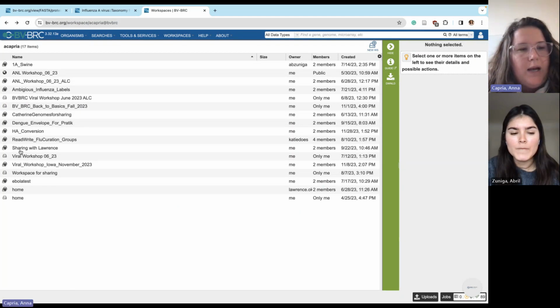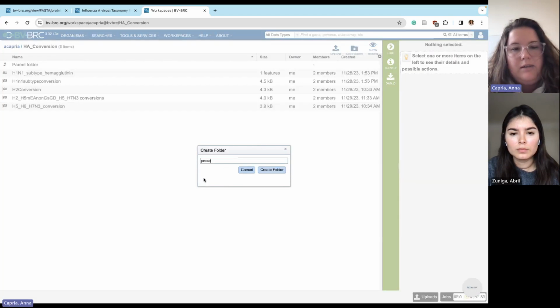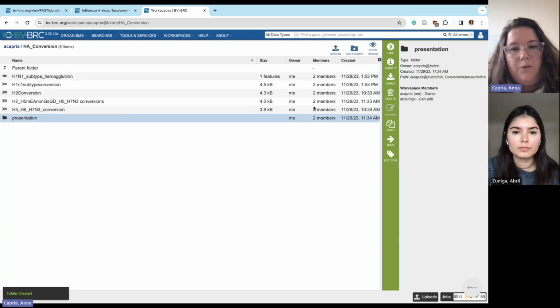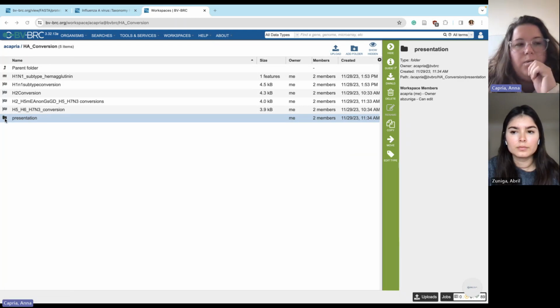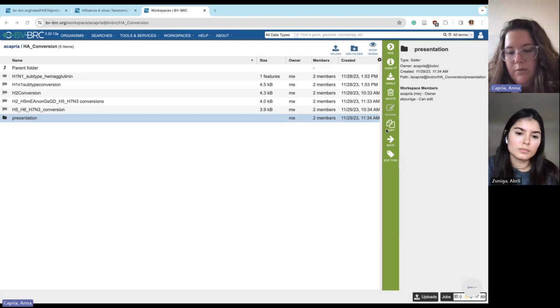But sometimes we will have a subfolder in a workspace, and you'll want to share that folder with somebody, and you'll see that there's a folder icon instead of a workspace icon. Folders can't be shared, so you can copy a folder somewhere, but you can't share it like you would share a Google Drive folder or a document on Microsoft OneDrive.